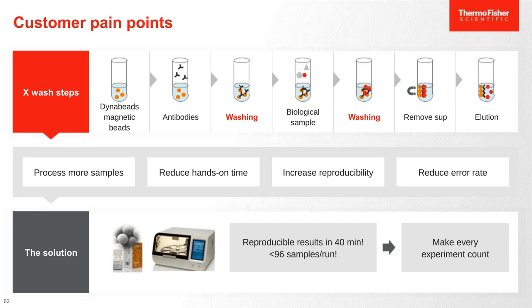They also would like to increase reproducibility, so that they can compare their experiments better. Very interestingly, they also would like solutions that allow them to spend their time more wisely, avoiding spending a huge amount of time in the lab pipetting and focusing more on the science. That's, of course, a scientist's interest. So they would like to have hands-off solutions.